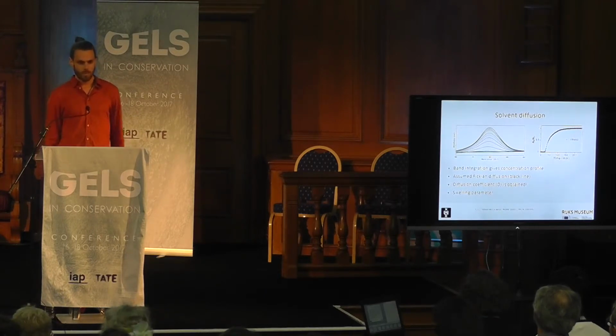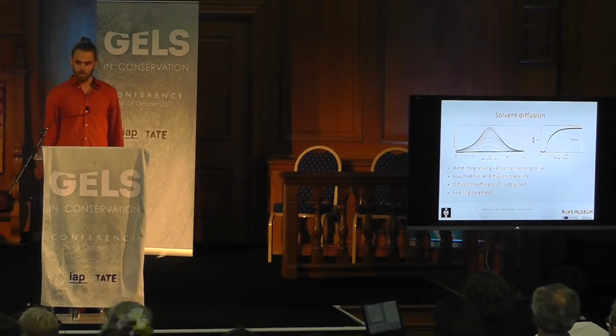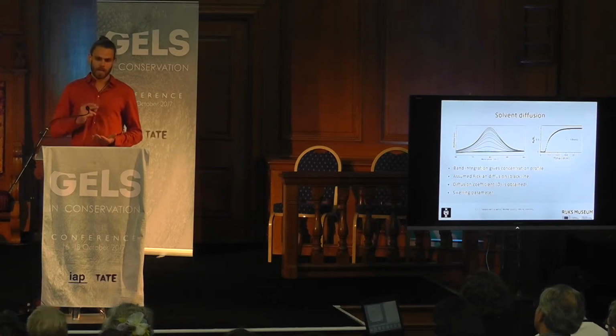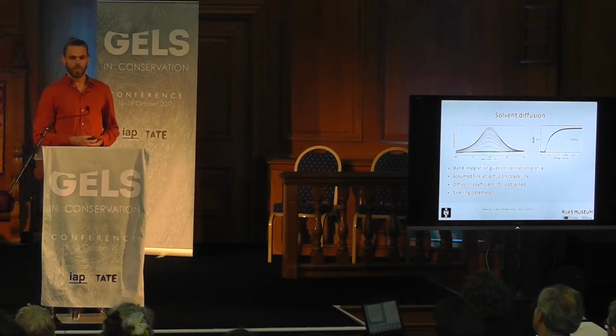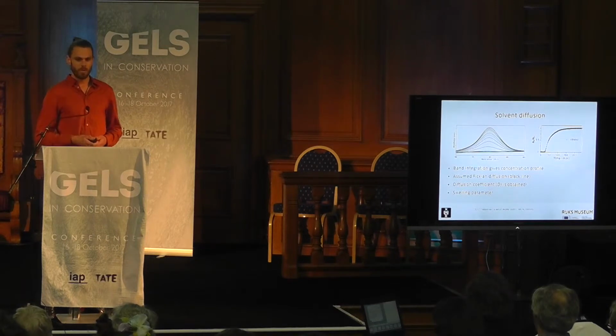And just as we can use this system to obtain the diffusion coefficients, it's also possible to obtain information about the swelling of your system. Basically, you have a measurement volume, and in the beginning you don't have any solvent present. However, as soon as the solvent starts diffusing, the measurement volume is filled up with solvent, and the effective concentration of your polymer goes down, which is a measurement of the swelling.